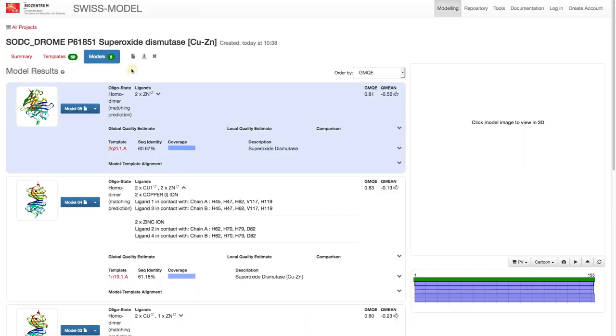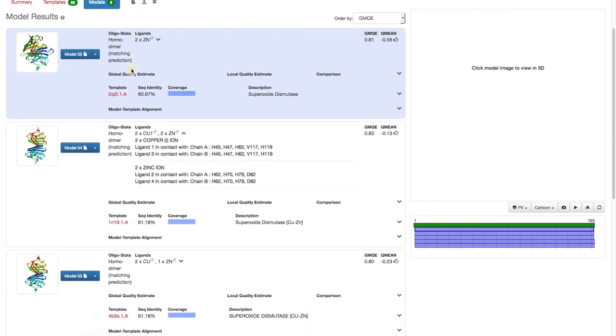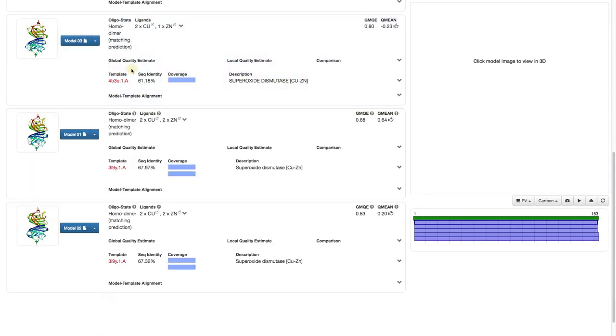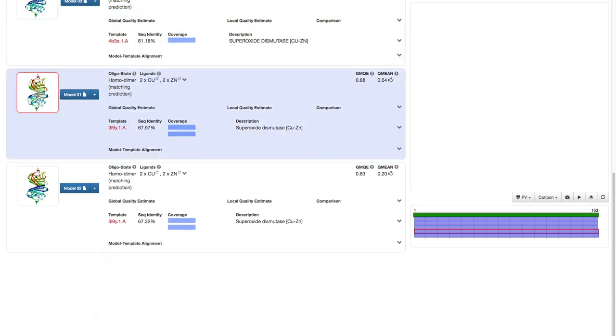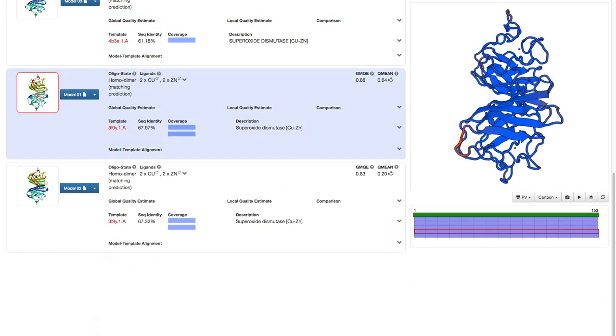Once the models are built, we are on the Models tab. Click on the picture to select the first model. We see once more the oligomeric state and the ligands.